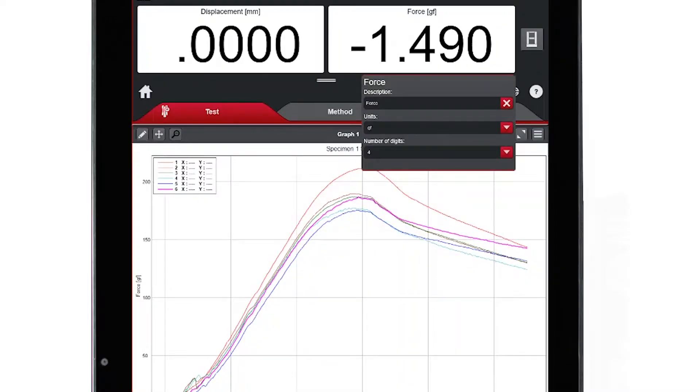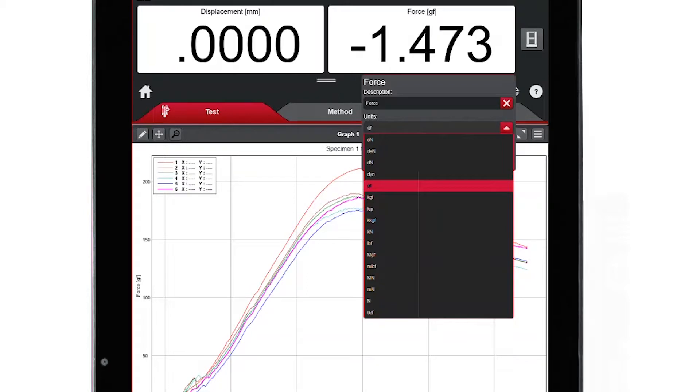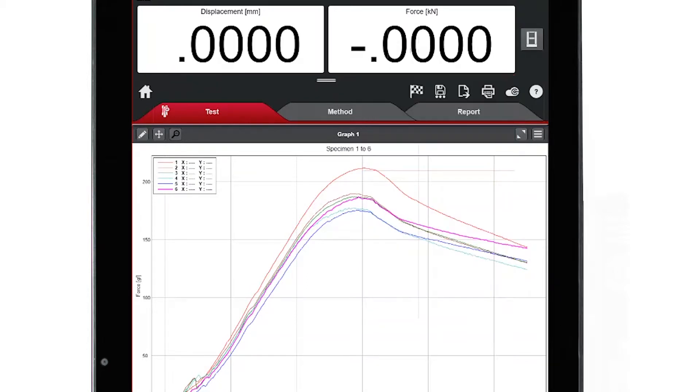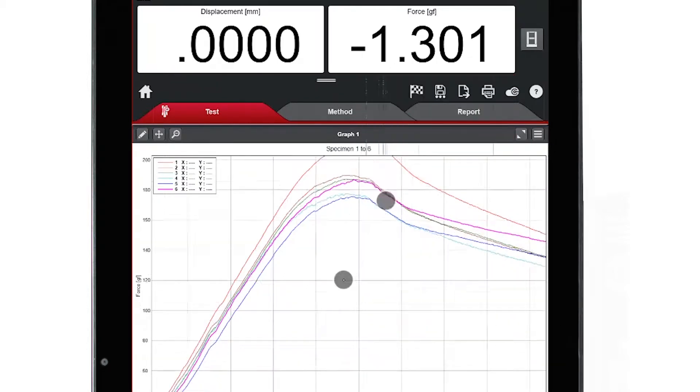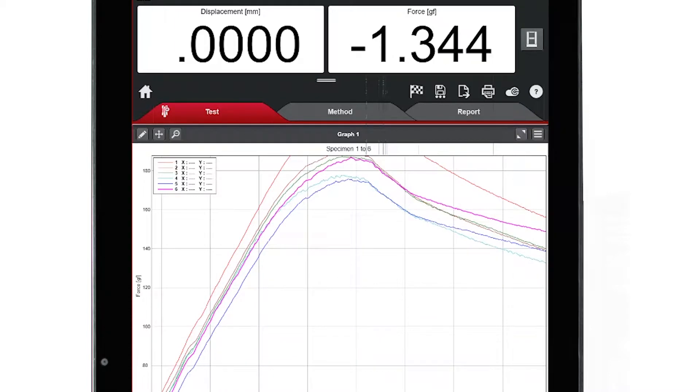By tapping on the different workspace components, I can do things like change units and zoom in on my graph.